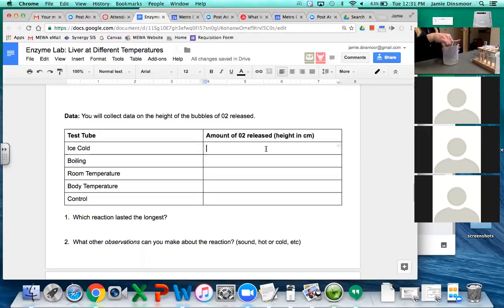We'll just let that chill for a little bit. I'm going to get my phone so that we can be Snapchatting this because it's very important to me. So make sure you write down 11 centimeters. We're going to do my other phone, my work phone, because I have two phones. We're going to do the ice cold one next. Check the body temp one. See if it needs to go back on for a couple of seconds.